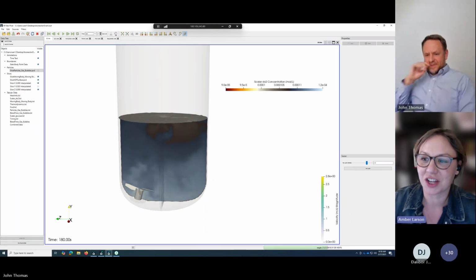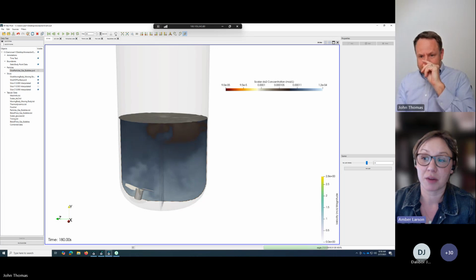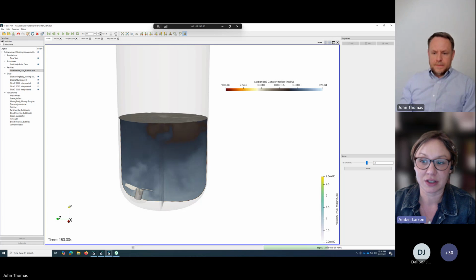This session is very intriguing, John. I am modeling a case with combo bottom impellers in a bioreactor. Well, we add 2 impellers as a moving body. Is it possible to try running them at different positions relative to each other, or will they always be at a particular selected point of coordinates?